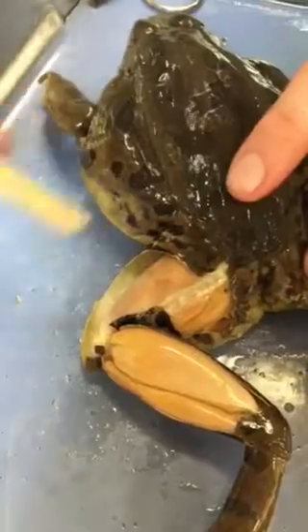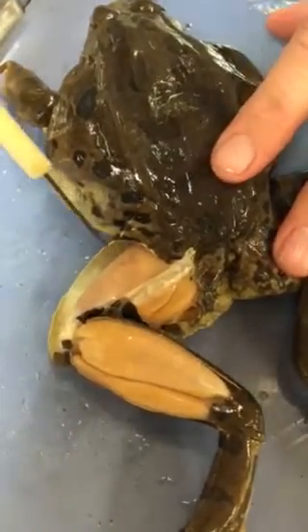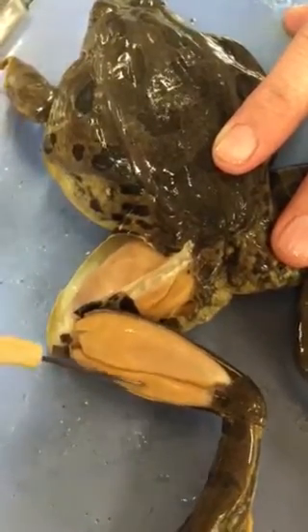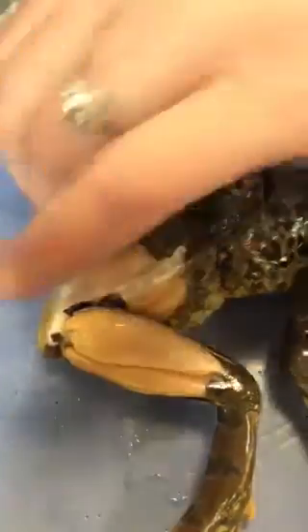And then you've got your muscles. You've got this big one up here. This is the leg. This is the femur. It would be the bone that would be here. So this is the triceps femoris. And then down here, you have your gastrocnemius, which is basically the big old calf muscle.